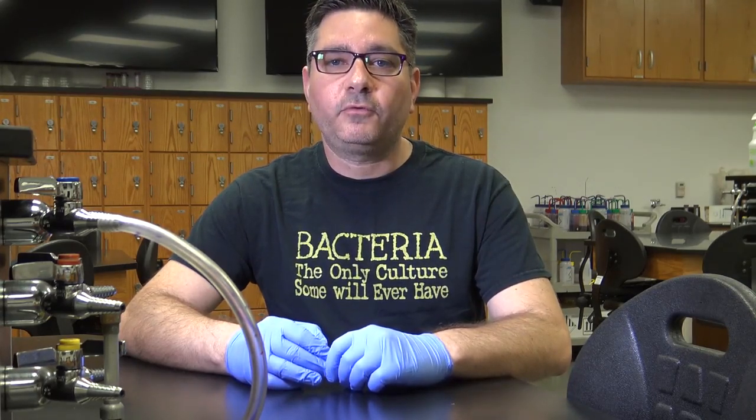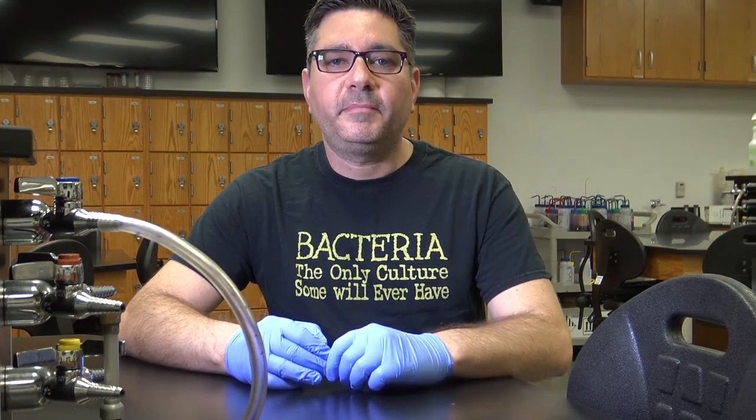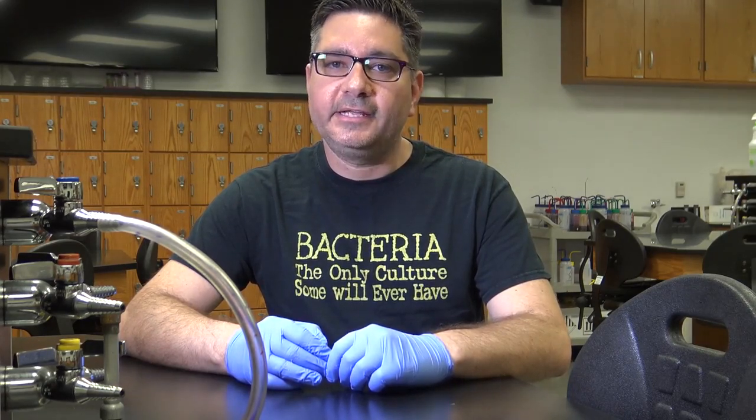This medium allows for organisms to grow in a liquid, which allows you to measure growth by the level of turbidity or cloudiness present after incubation. The more turbid the liquid medium, the more microorganisms that have grown.